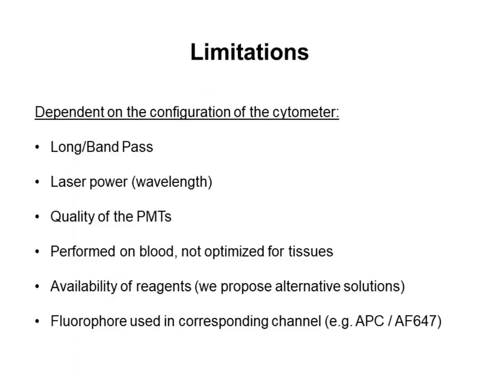Of course there are still limitations when you run such experiments, and it depends a lot on the configuration of your cytometer. What we are showing you today is on one instrument, the Symphony, and each instrument has slight differences. So you need to test this again based on your filter configuration, the power of your laser, and the quality of your PMTs. Is it something you're doing on blood? We did it on blood, so we have not necessarily optimized it for tissue.